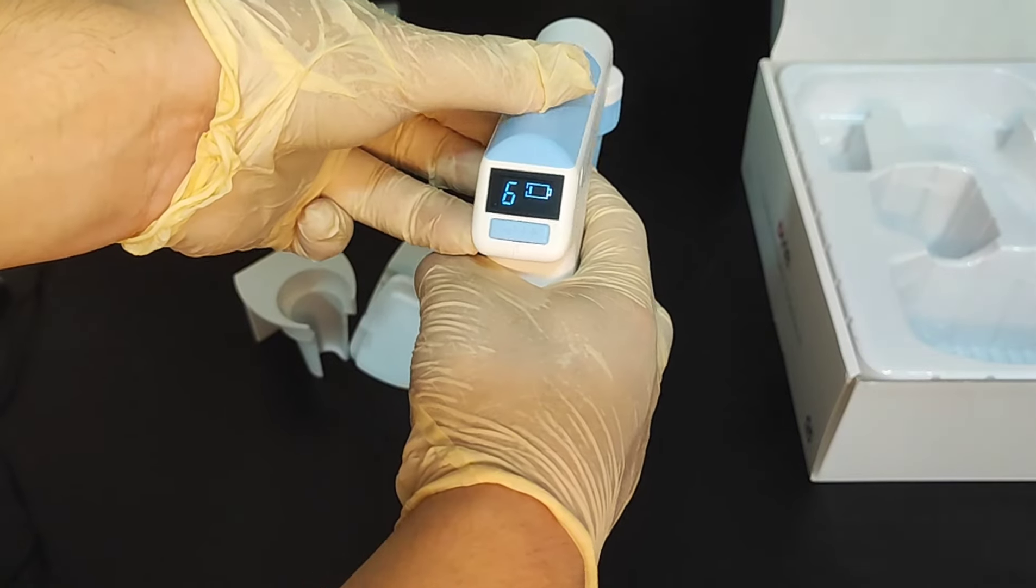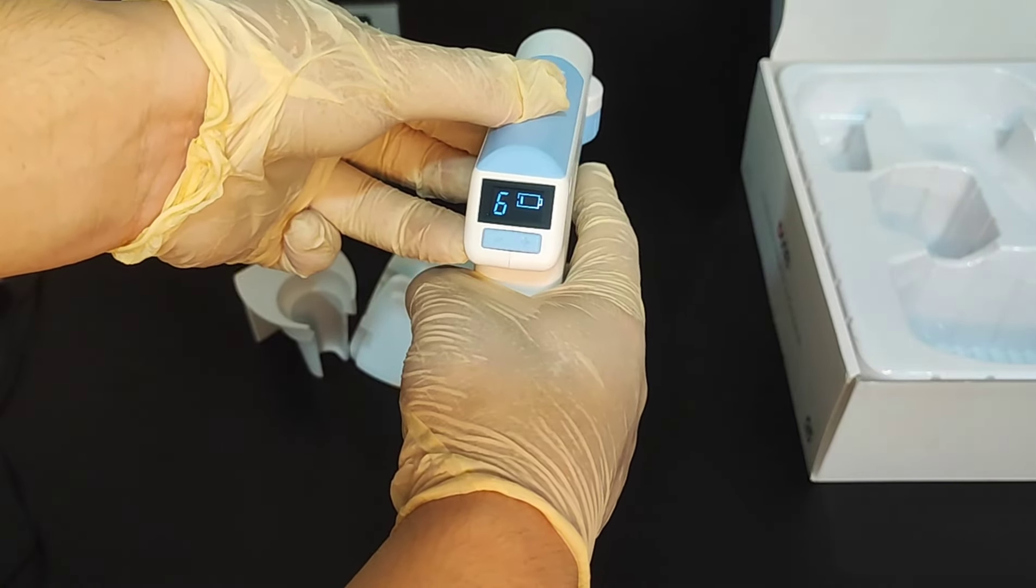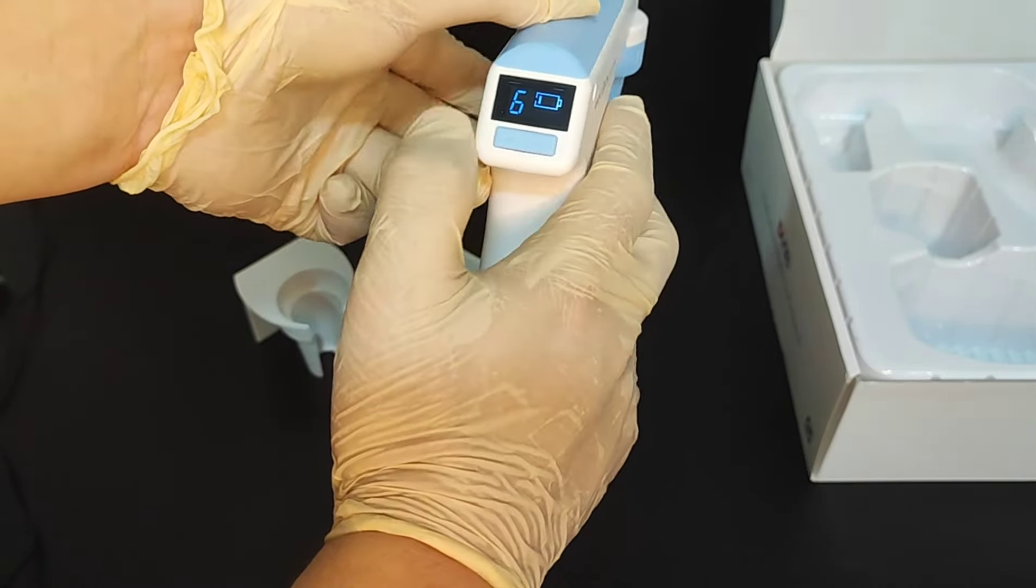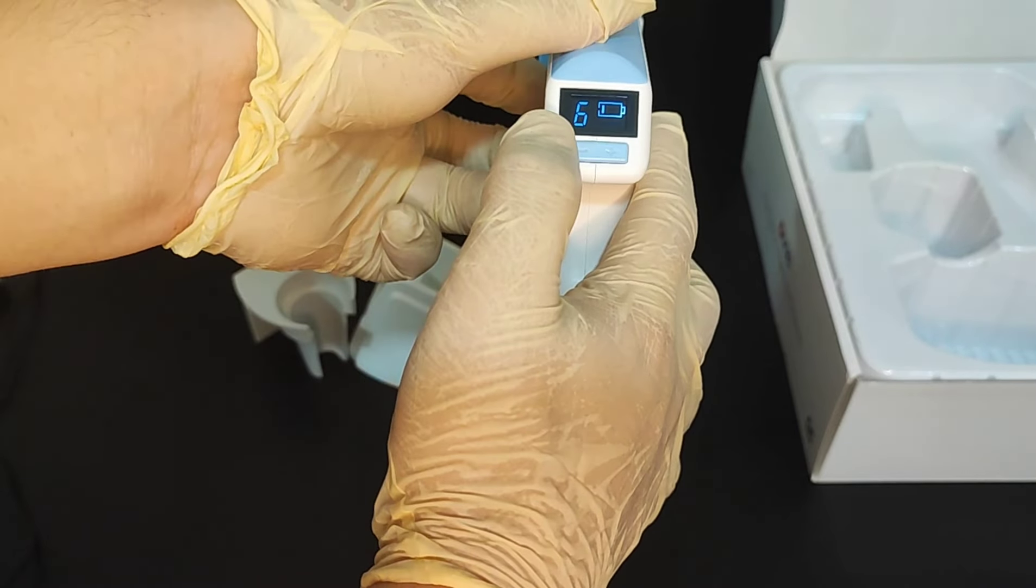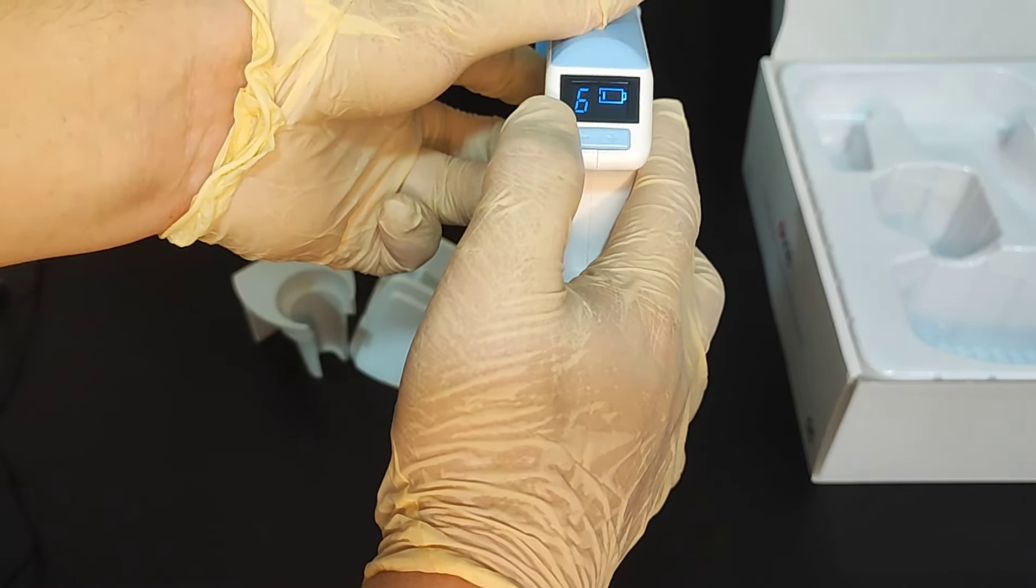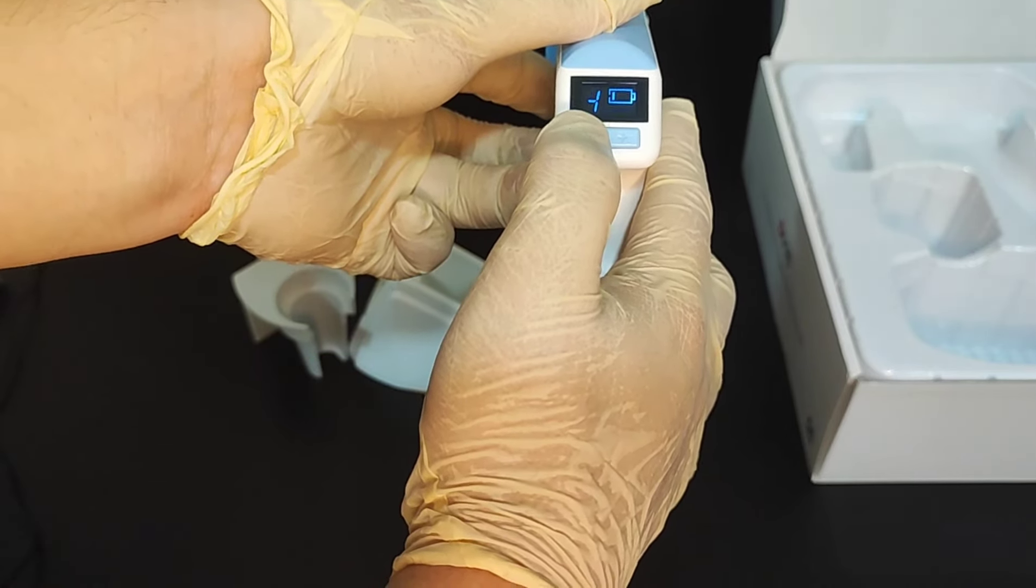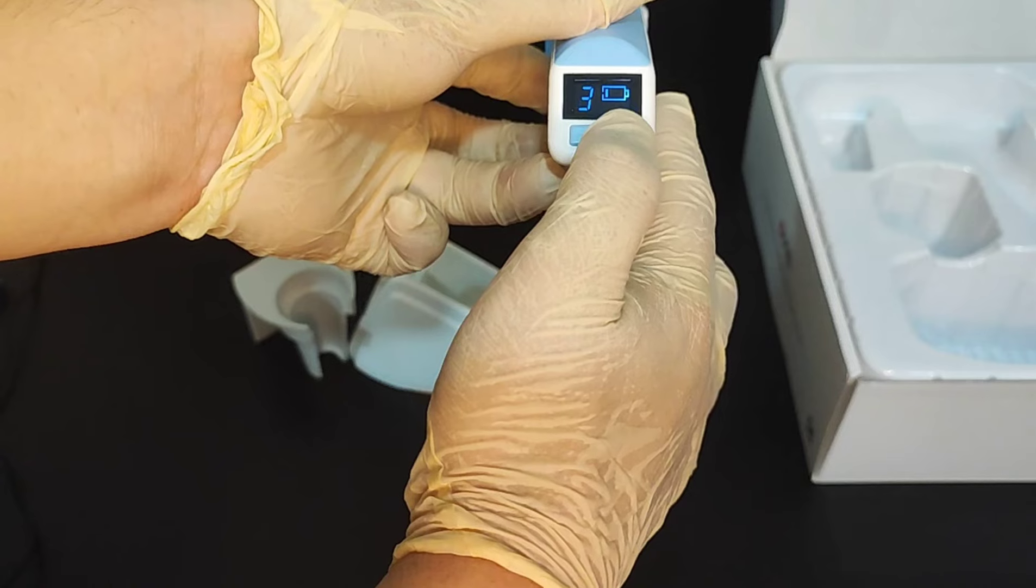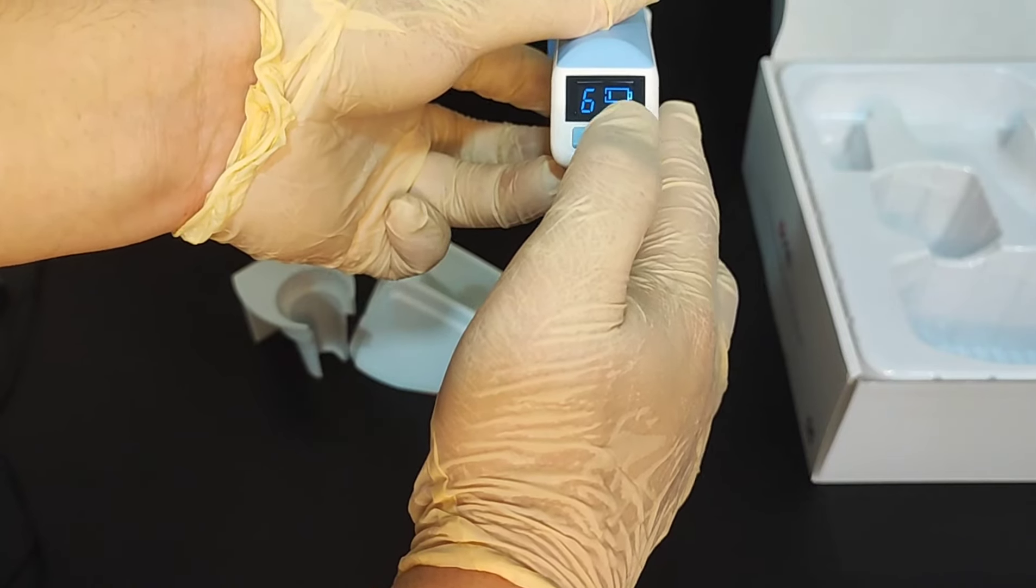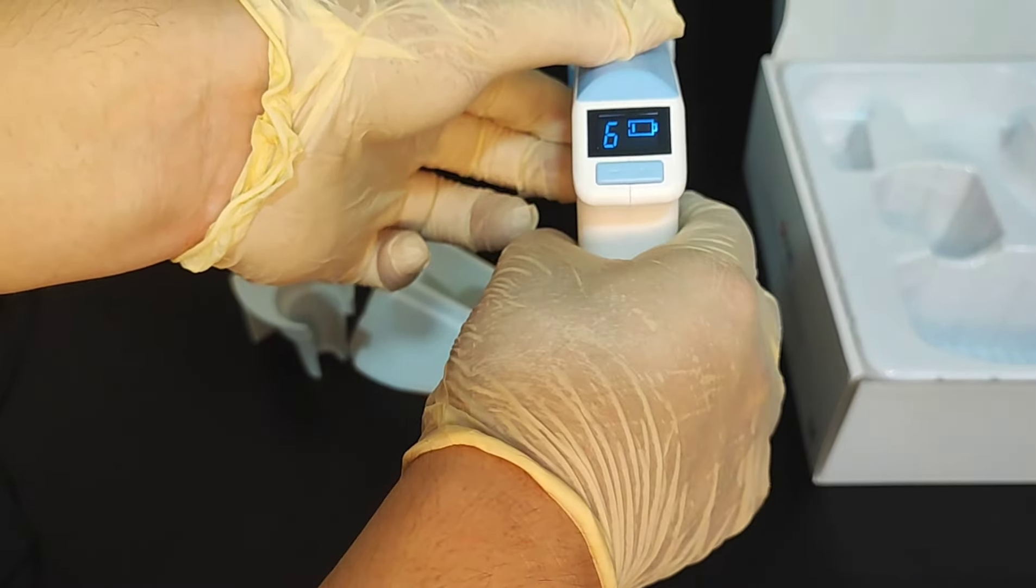When we push the suction trigger, the machine will automatically turn on. This is speed six. Speed six is the highest speed. We can reduce it. Five. Four. Three. Two. One. And we increase. So this is how we adjust the pipetting speed.